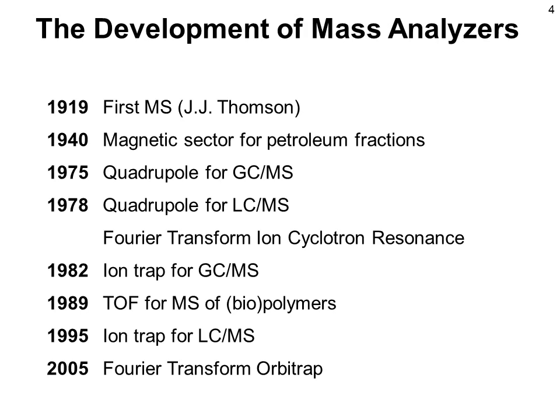Around the same time, physicists developed the Fourier transform ion cyclotron resonance mass analyzer. Here, ions are trapped in a very strong magnetic field of a superconducting magnet. This magnet has to be cooled with liquid helium to remain in the superconducting regime. Ions circulate in this magnetic field according to their mass-to-charge ratio and give certain resonance frequencies. We will not allude to this mass analyzer very much, as it is not really used in bioanalysis. It's difficult to handle and fairly expensive to operate.